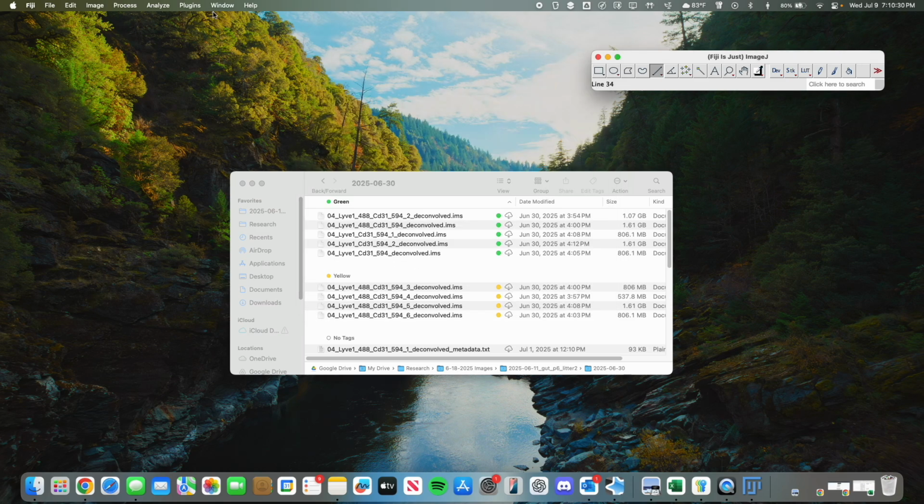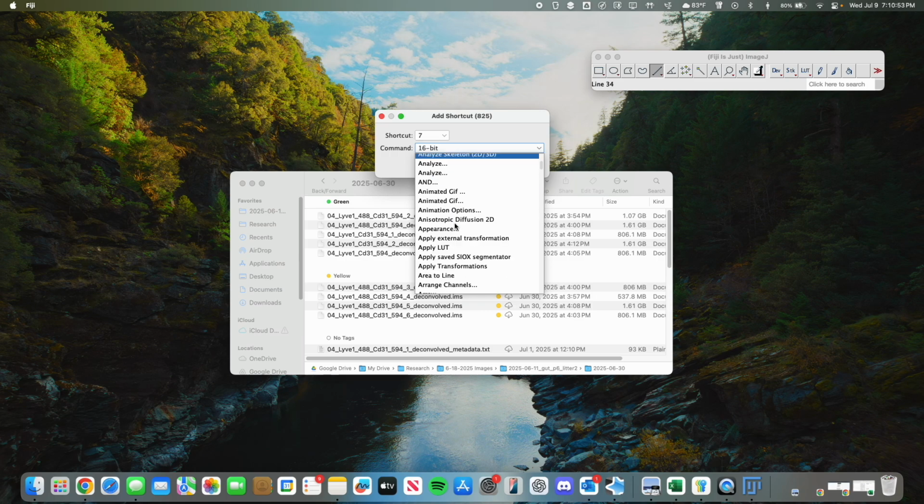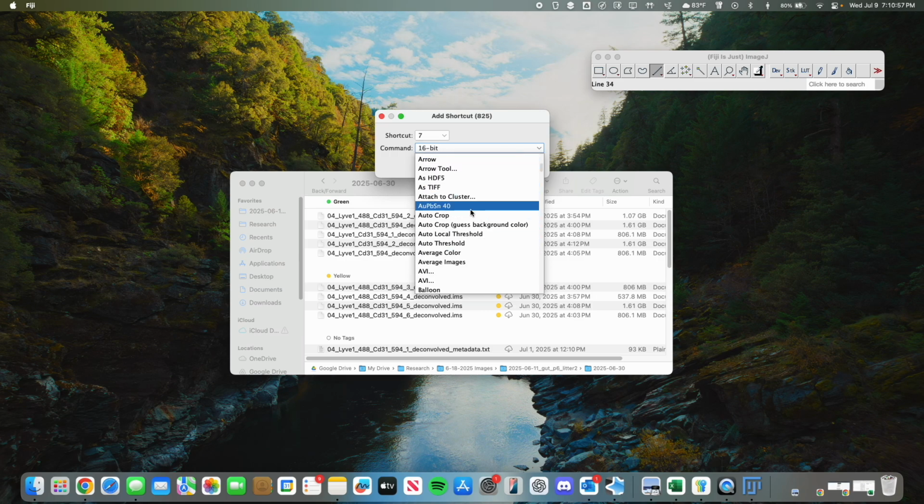So if you want to add a shortcut, you can just go Shortcuts, Add Shortcut, and then it'll automatically have them. But if you have a name of one that you've already done, that you know the name of, you can go ahead and input that in. But if not, there's a bunch of different functions on here that you can go ahead and assign to a keyboard value. And yeah, go ahead and choose that to your liking.